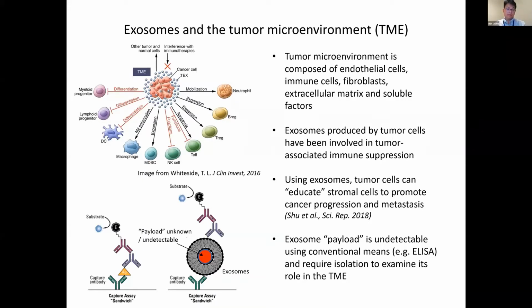For example, lysis. Whether the exosome contains a cytokine payload is something that I am not going to cover. I am going to just focus on cytokines that are outside exosomes, so they are not related to exosomes. We want to be sure that we get all the isolates as pure as possible, so that if the payload is studied, we can work with certainty that it is about the payload and not about an external co-elution. Technically, that's the bar we should set, even though the technology is not there yet to reach such high purity at this point.